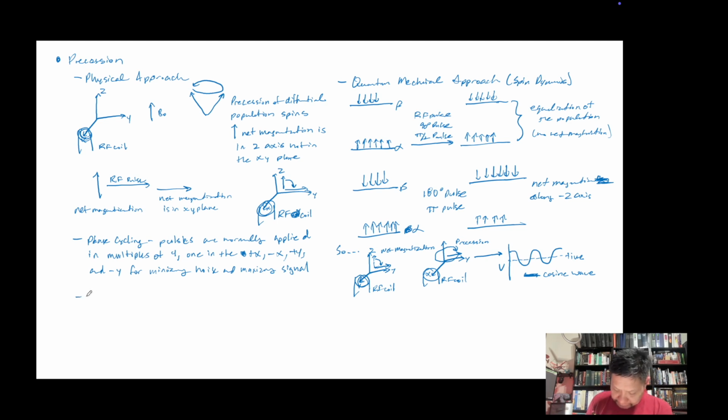So let's put all this together now. First thing to say is, as the proton with a net magnetization precesses or rotates about the z-axis, it induces a current as it approaches the RF coil. I always spell magnetization wrong. You can just look it up later.